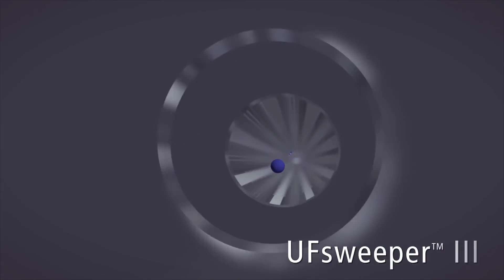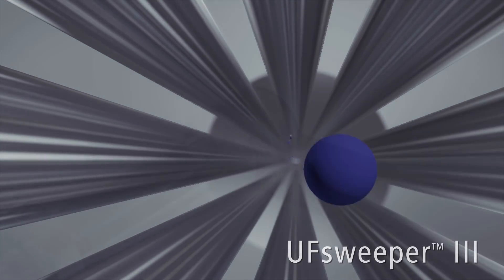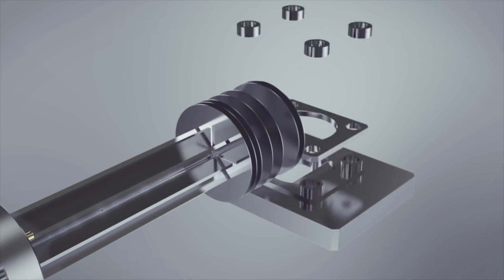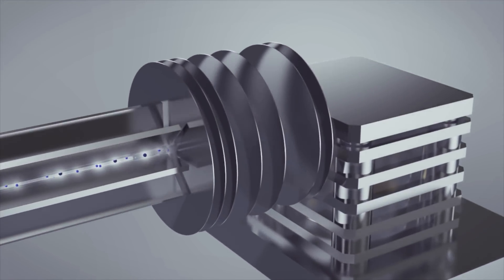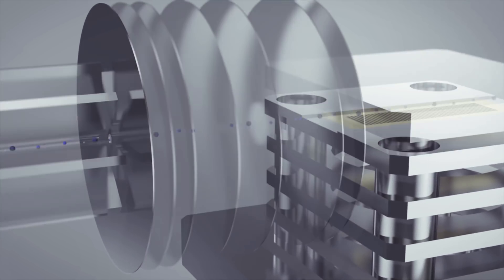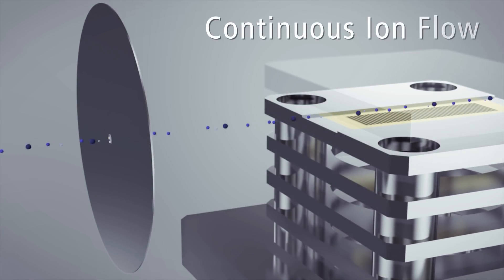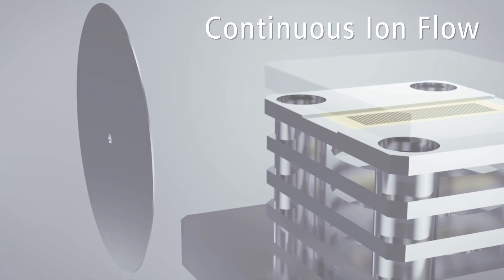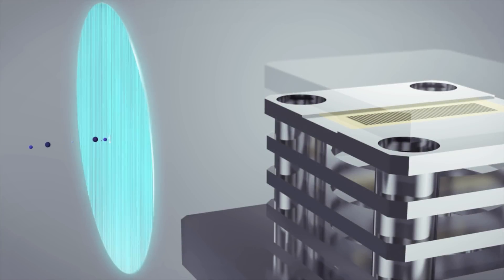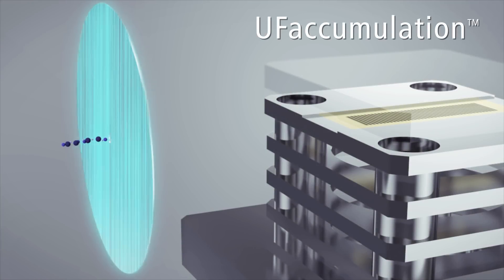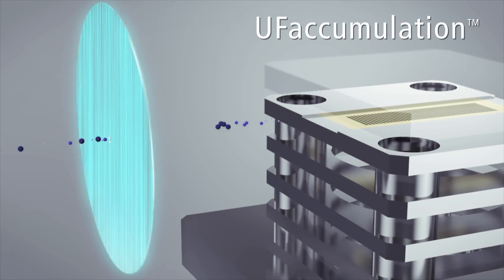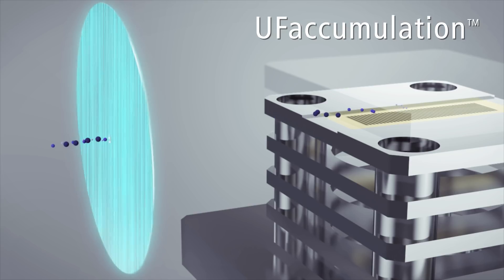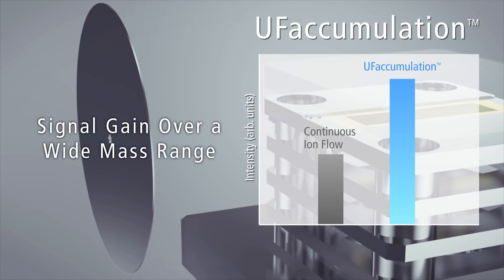The UF-Sweeper 3 helps prevent loss of ions over a wide mass range for increased sensitivity.